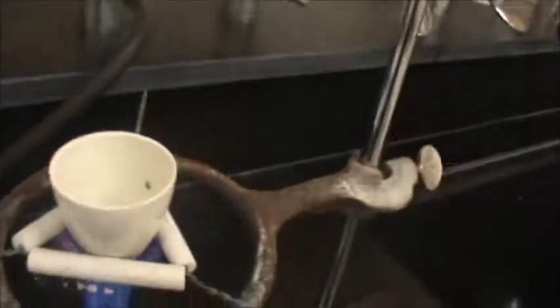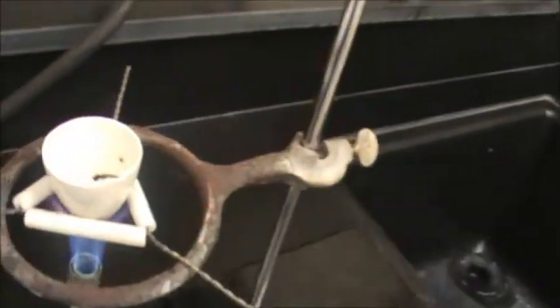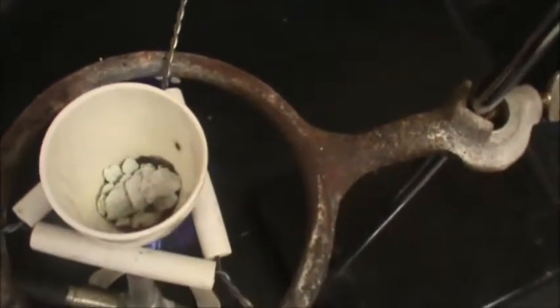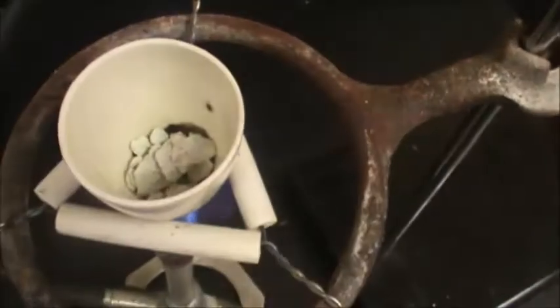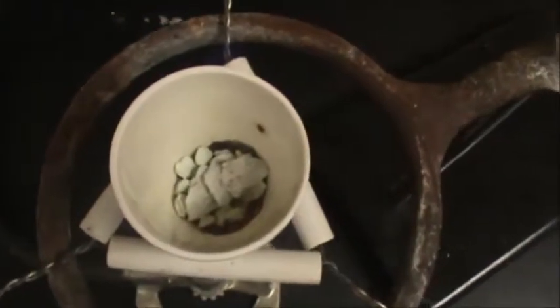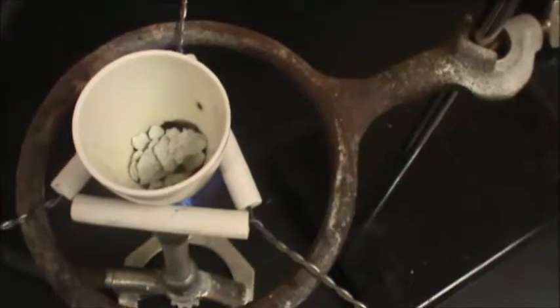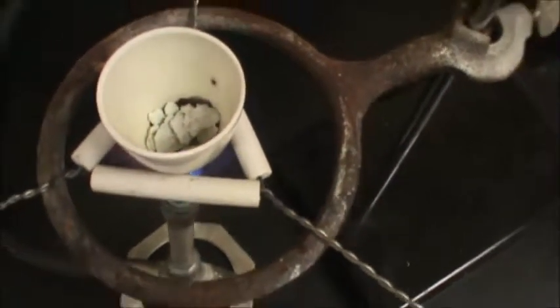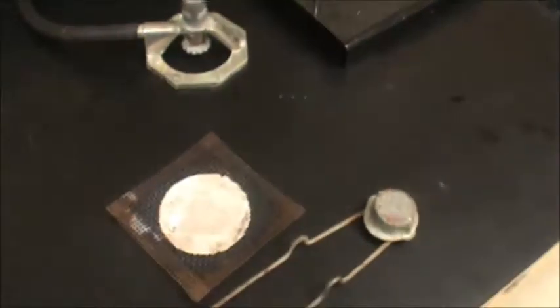Now that we've been cooking this for a long time, I'm heating it very vigorously with that hotter flame, and it's getting in contact with the bottom of the crucible. I look at my blue crystal that was once blue, now it's completely dried out, it's dehydrated. I have nothing but white crystalline. It's a chalky solid. It's not the same appearance as when it was a bright blue color. It was kind of pretty back then. Now I think it's reminiscent of kitty litter. So I'm going to take this and bring it down to my wire gauze to let it cool off.